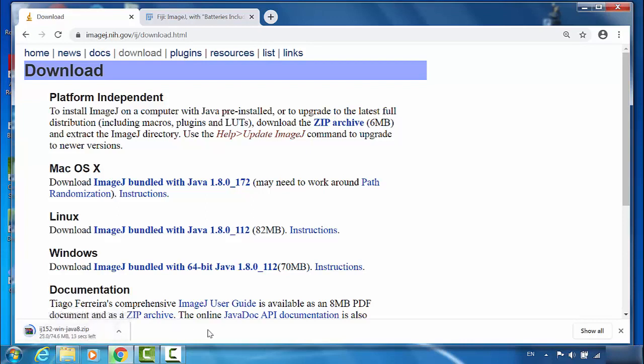NIH ImageJ is the ImageJ core. That is a much smaller size, only 75 megabytes. I'll just wait until it's finished downloading.